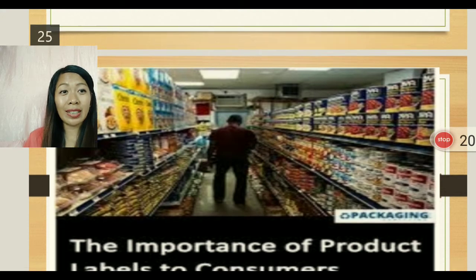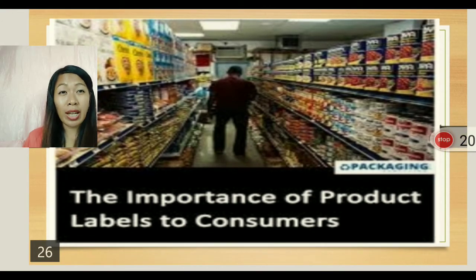Just like the importance of product labels to consumers in a grocery store, proper labeling of food is also the same with chemicals, so that when we use them, we can easily access them, and it saves time and effort.